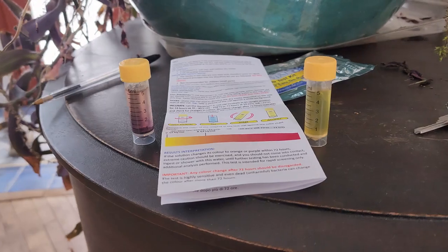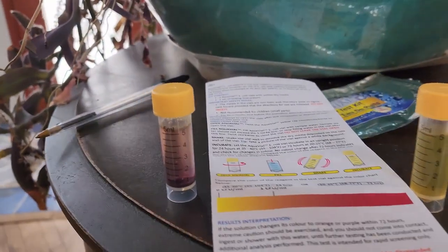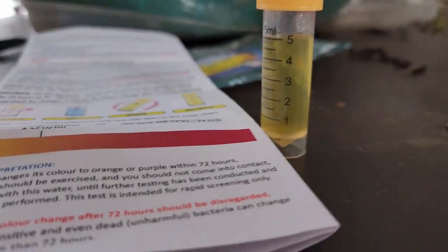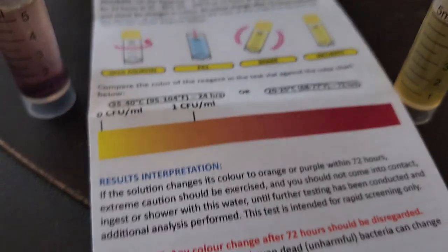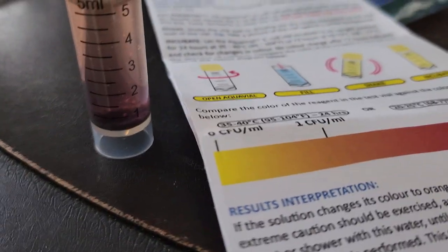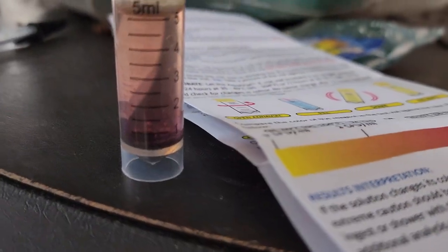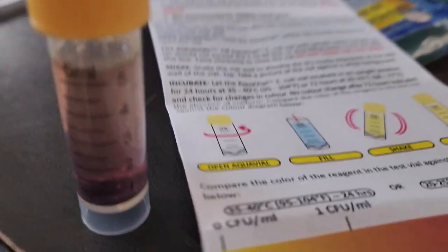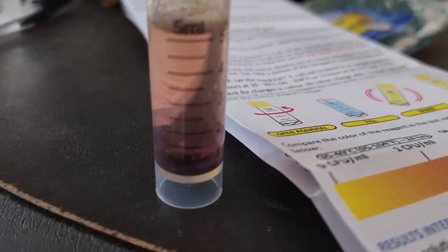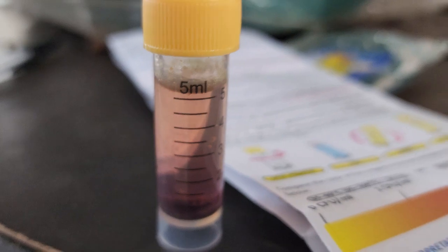It's been 72 hours since I put these samples together, so now it's time to check. They've had time to incubate. If we look at the sample that I took after they cleaned everything out, that's nice and yellow like the left of the sheet says. But if we look at the sample from the gunky crap that I took out of there, that's red — that's over to the right of that one CFU per milliliter line, meaning that there is E. coli in there somewhere.